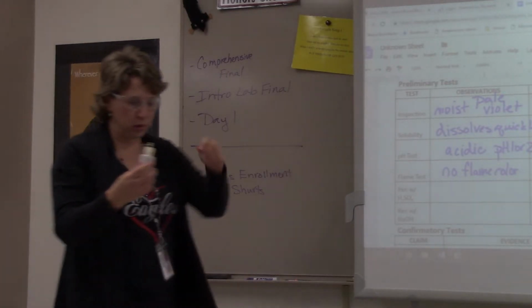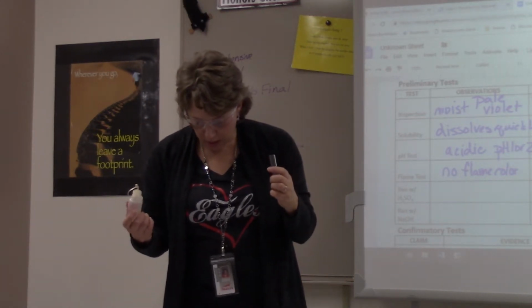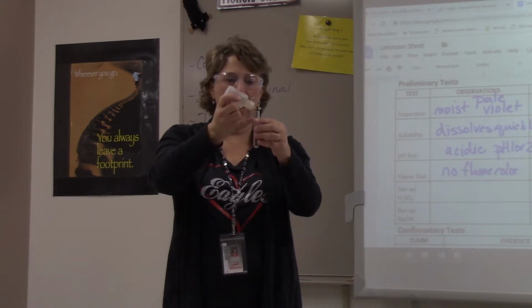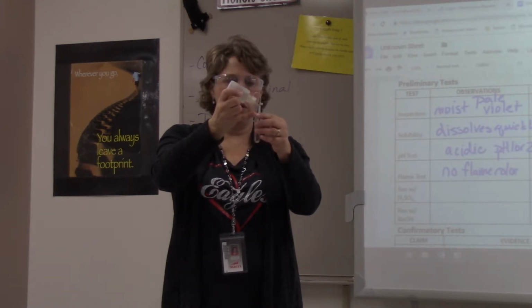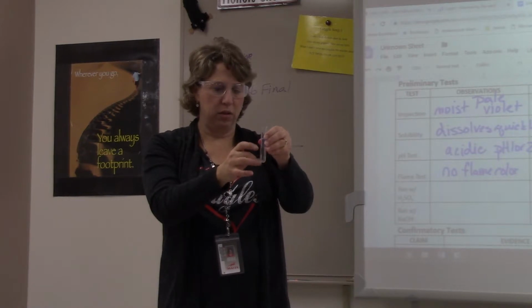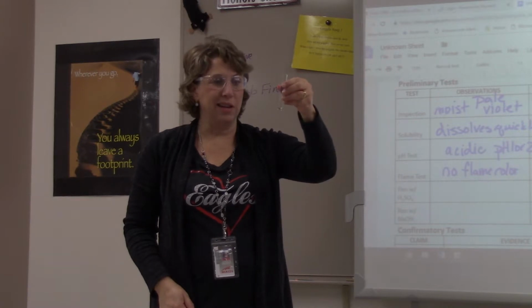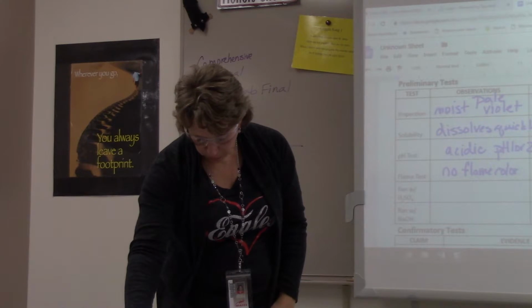Okay, so we're going to add dilute sulfuric acid to our test tube of our unknown, and I am going to make sure I add 1 drop at a time, and I want to make sure that I don't add more than how many drops? 5. Alright, so I have now added 5 drops of sulfuric acid. I'm going to mix that a little bit. And as I'm looking at that 6 molar sulfuric acid, am I having any reaction? No. Okay, so I've had no reaction with that.